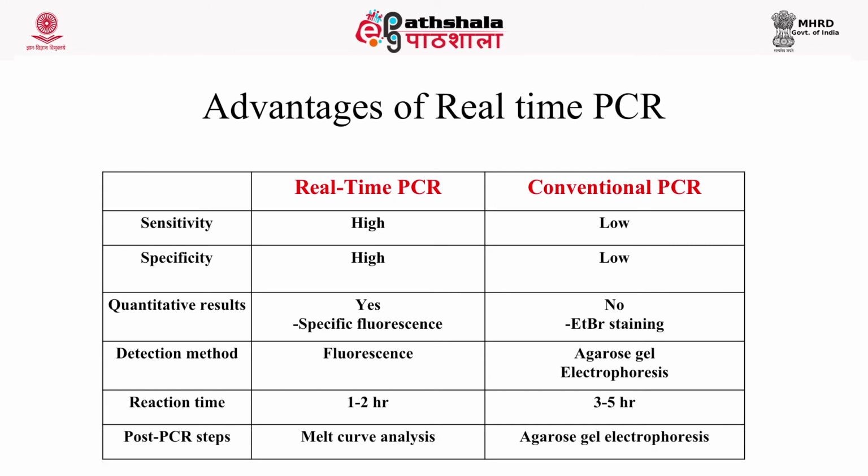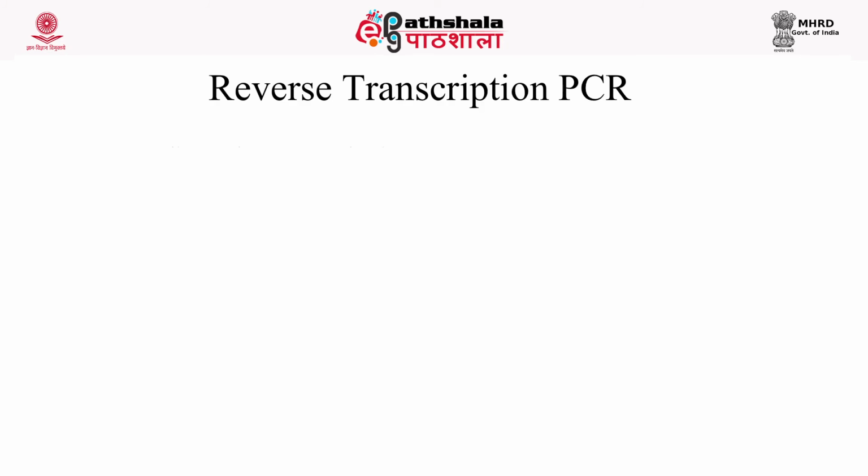Post PCR, we can do a melt curve analysis in real-time PCR. However, we cannot do that in conventional PCR. After studying PCR and real-time PCR, let us see reverse transcription PCR. Reverse transcription is RNA-directed DNA synthesis.